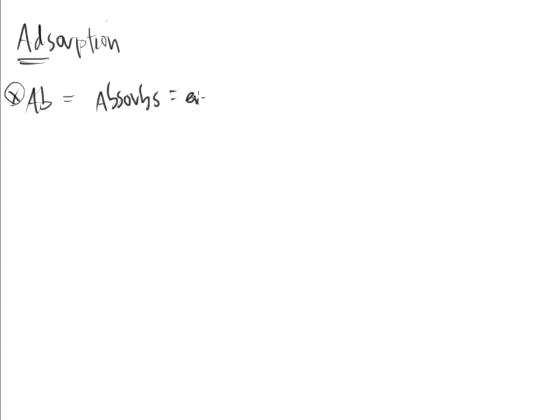So the term that we're going to use is adsorption with an AD, not an AB. I don't have abs, and adsorption doesn't have abs either. So adsorption is what takes place in chromatography. There's a slight difference between adsorption and absorption. Okay, so what's the difference? Well, if something absorbs something, what does that mean, right? So absorbs basically means engulfs in a way.